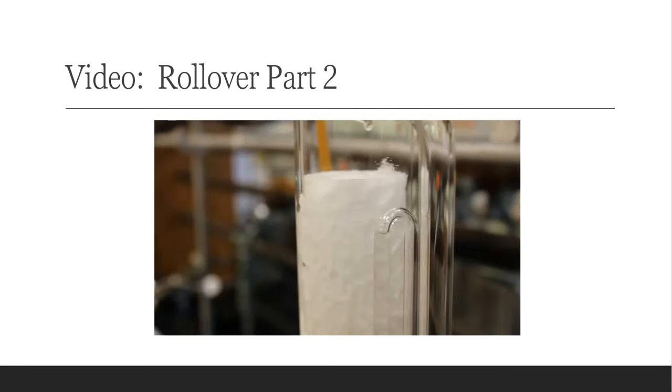This lets me showcase data, allowing someone to know that I did not rush this extraction through, and at the same time, I didn't take forever, because the longer it takes, the longer I have to let the Soxhlet do its job, right? If it goes too fast and I'm not giving the solvent enough time to extract any peanut oil from the peanut, then it's really not doing me any good either. So we have a target rollover time for every extraction that we do, and that's typically embedded into the laboratory procedure.